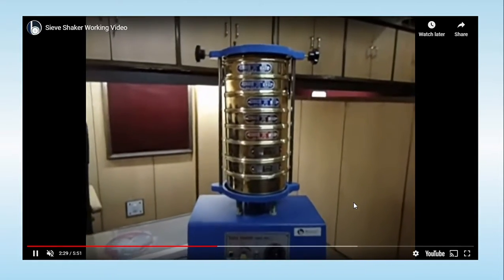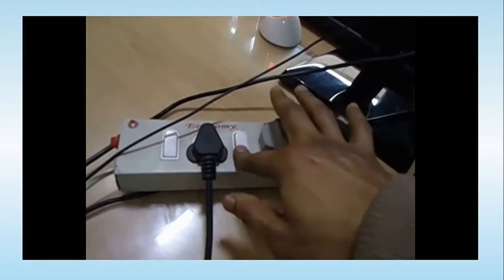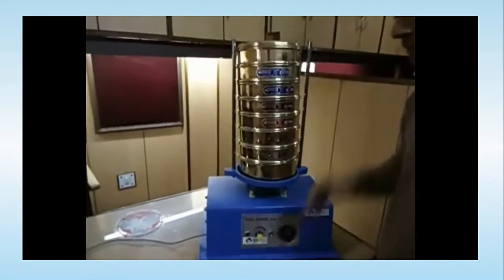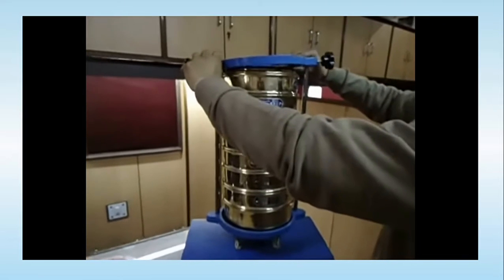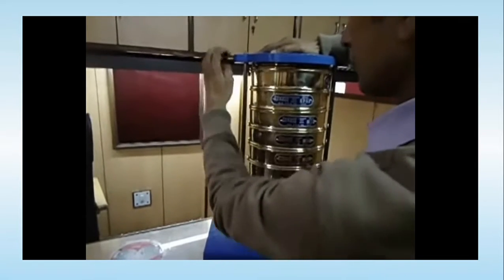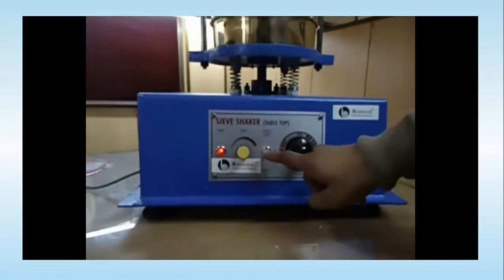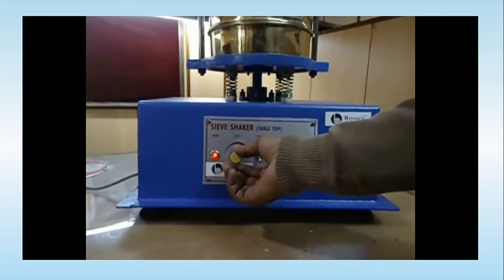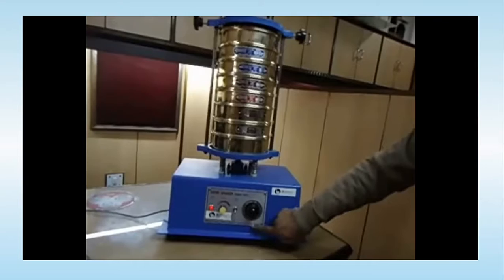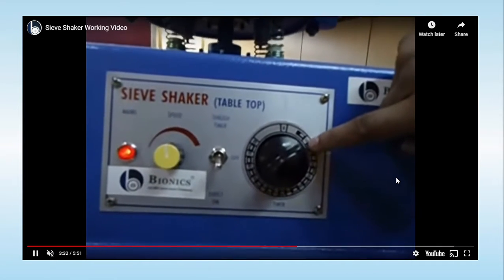Now all the sieves are fixed into the mechanical shaker, and the electric supply is applied, and the powder mixture to be separated is kept on the top sieve, that is the coarsest sieve with the lowest sieve number. The important part is that whatever powder mixture we want to separate, we have to take a definite weight. We measure the weight, and that definite weight of the powder mixture is kept on the top sieve, the coarsest sieve with the lowest sieve number, and is rotated for a particular period of time at a particular speed, and then it is stopped.